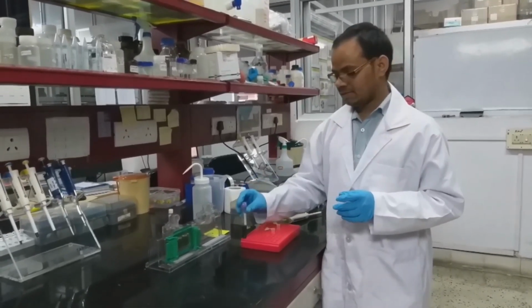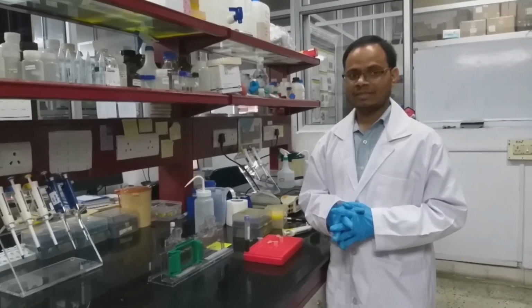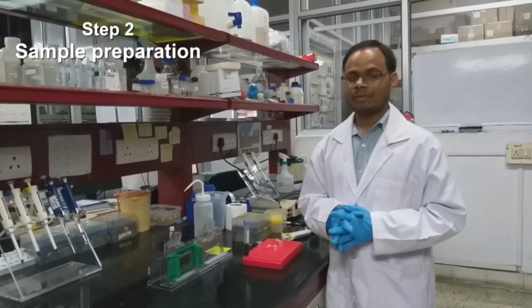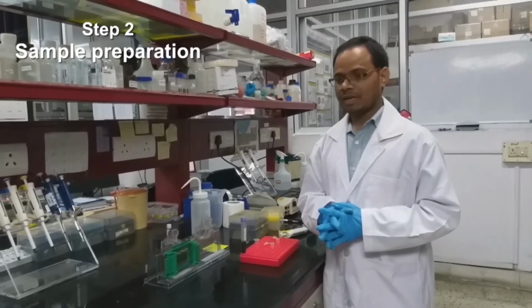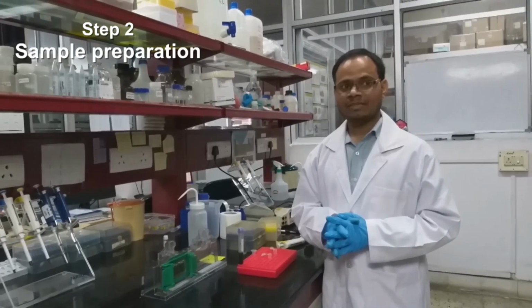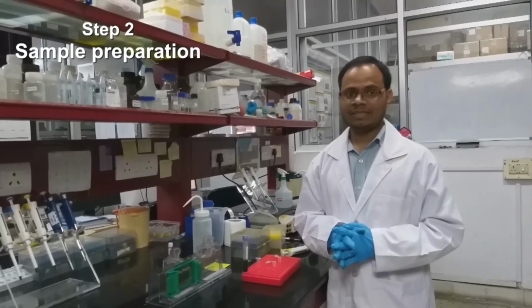It mainly contains 250 millimolar Tris pH 6.8, 30% glycerol, 10% SDS and 0.05% bromophenol blue. So here we can add 10 millimolar DTT also as a reducing agent. SDS mainly works by imparting negative charge on the polypeptide chain, and DTT breaks down the disulfide bonds.